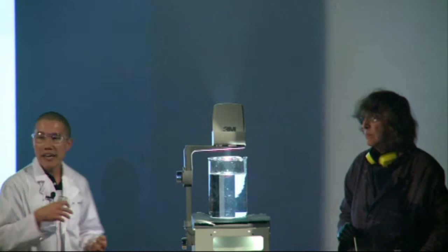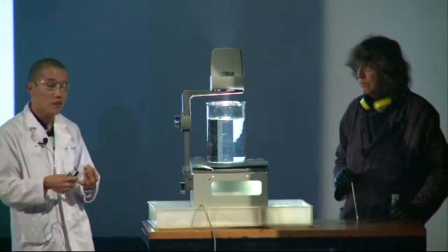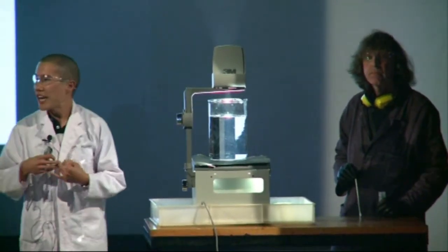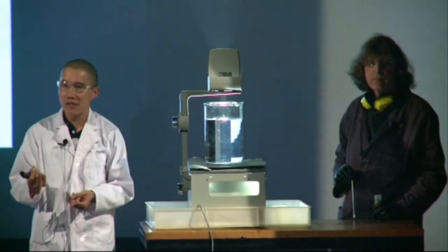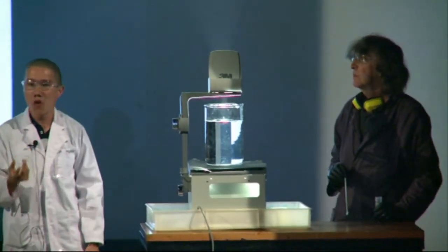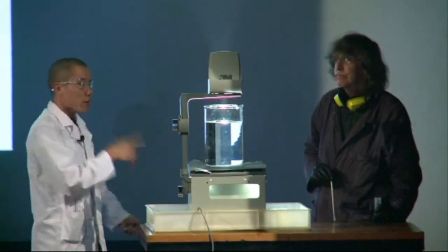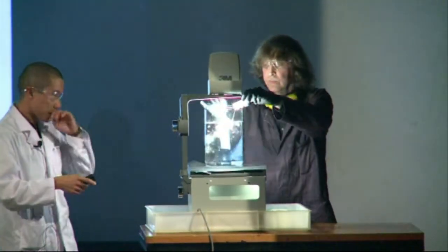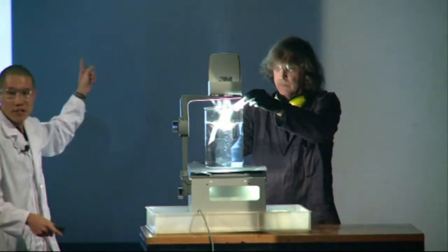So what we're going to do is mix in another clear, colourless solution, a chemical called sodium thiosulfate. When sodium thiosulfate reacts with hydrochloric acid, it produces tiny particles of sulfur. And these tiny particles of sulfur scatter light, and in particular, they scatter more blue light than red light. So Graham is now going to mix the sodium thiosulfate into the hydrochloric acid. I want you to pay attention to the colour of the solution and the colour of the spot on the screen.